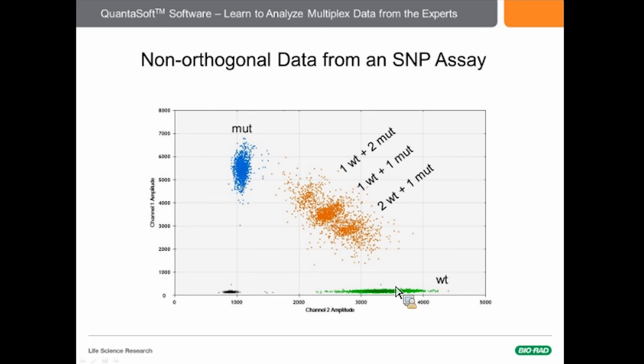Next question that came in. Would it be possible to get some information about what the algorithm is for determining the clusters? For this one, the algorithms are actually proprietary, but if you give us a call, we'd be able to give you some general details and go over that a bit further.